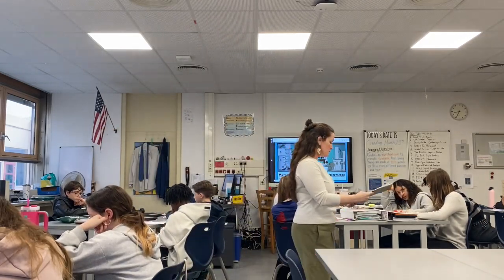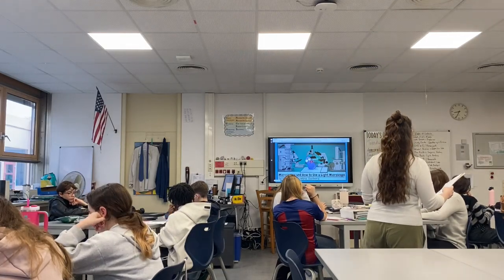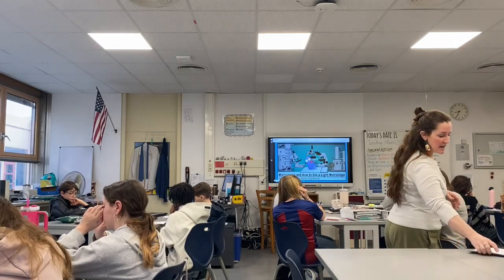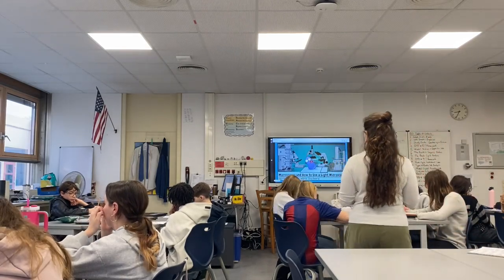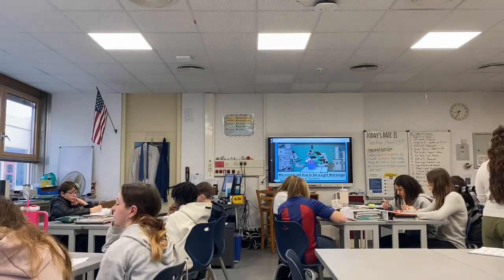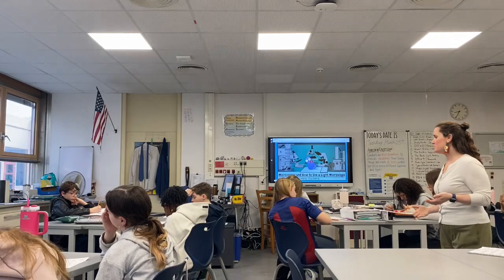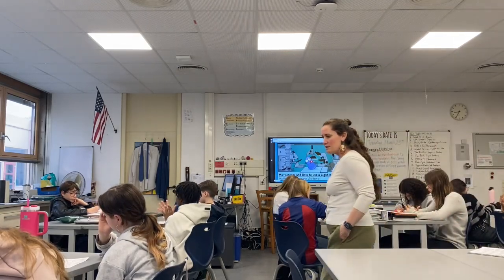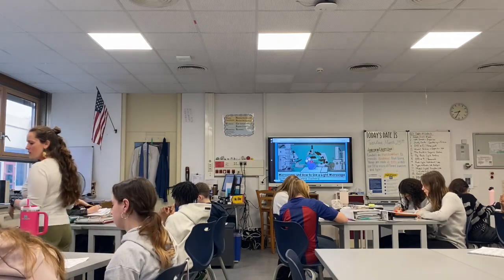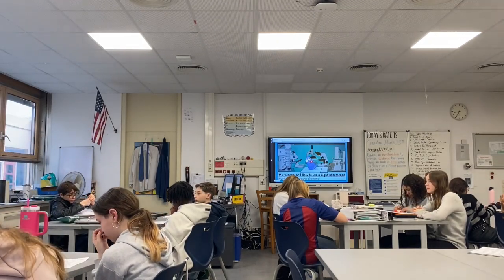Oh, okay, yeah, are you talking about the scanning objective times the eyepiece? Okay, yeah, so when we look at the objective lens, it might tell us 4x, 10x, or 40x, but we have to remember that our eyepiece also gives us a 10x magnification, so it's actually 10 times what it tells you on the objective lens. So that's what you would get there. Did anybody write down what they're actually called? Megan has them written down. What did you put?